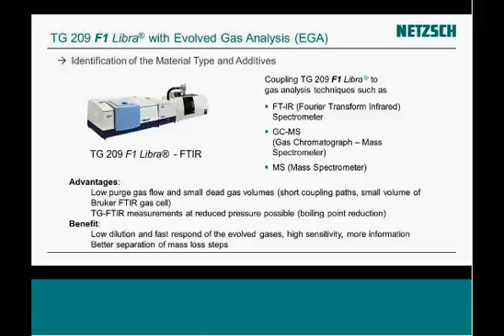And TG-FTIR measurements at reduced pressure are also possible, which will enhance the separation. Sergey will talk about this example in his second part.